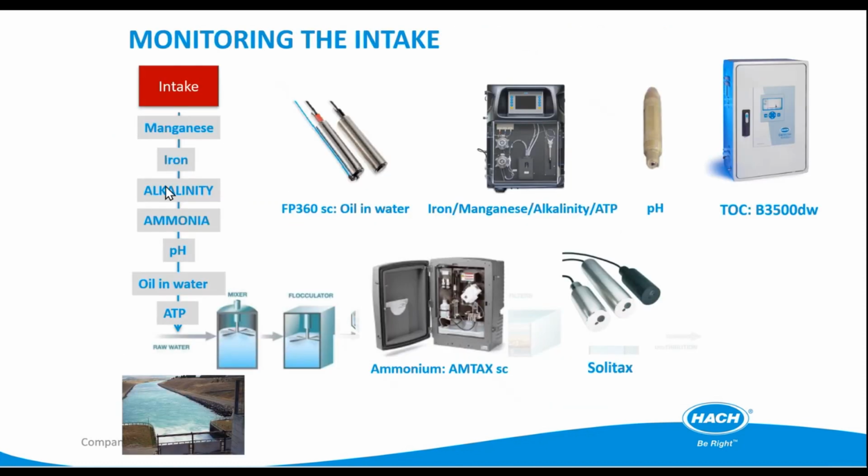Okay, so some parameters that we need to monitor at the inlet of the drinking water plants. There shall be manganese and iron. Manganese and iron can also be very high for river water and also groundwater. And sometimes we also need to monitor alkalinity, ammonia, pH, oil in water, and ATP. ATP is the indicator for virus or bacteria. So for bacteria, we monitor ATP for online application.